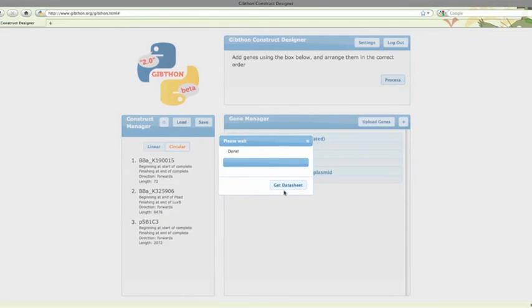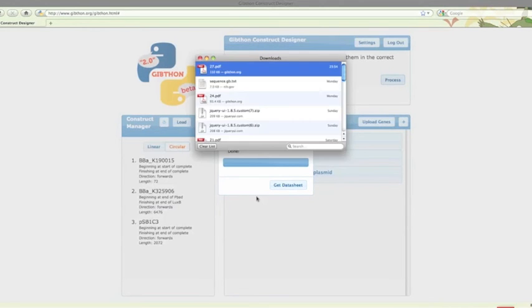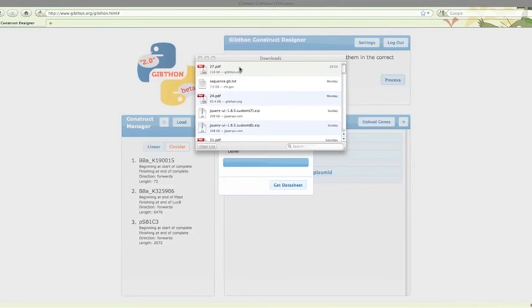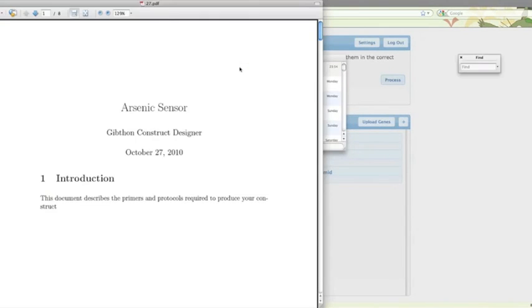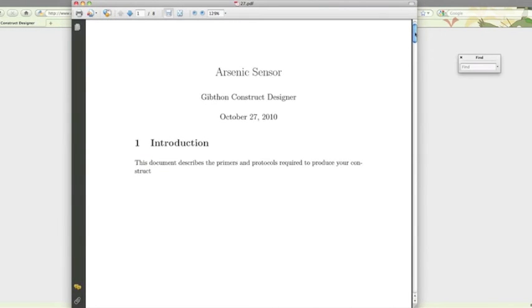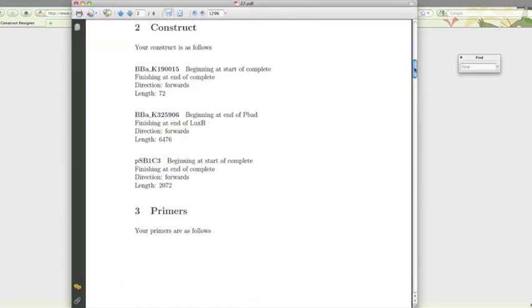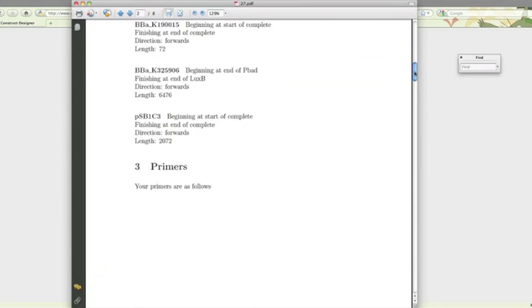When it's ready, we'll get a PDF with a description of the construct, and then datasheets for all the primers with the melting temperature for the annealing portion, as well as the whole primer, along with secondary structures and Gibbs free energy.